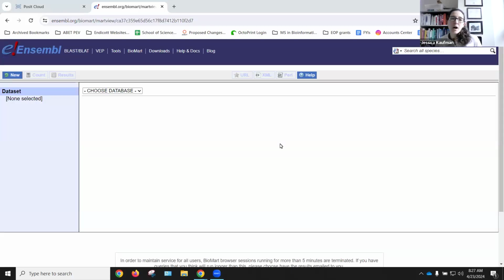In this video, I'm going to walk you through how to do a biomaRt search on the website and in R. And I think if you can see those two things back to back, it'll help you make sense of the scripts that you write as you design custom tools to describe different phenotypes in the human genome.